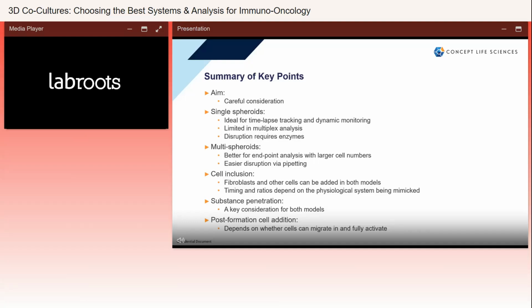Again, the single cell system is difficult. You can see where they go, but again, with the multi-cell system, you can obviously label a lot more examples of cells that are moving around. So there are advantages and disadvantages there. So hopefully that has helped go through here.